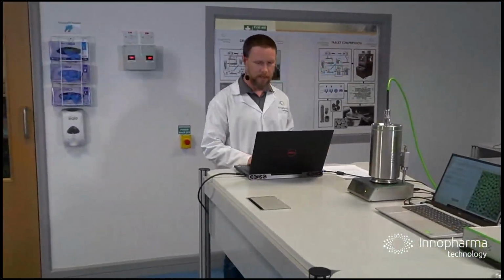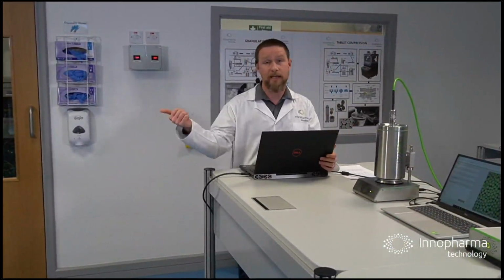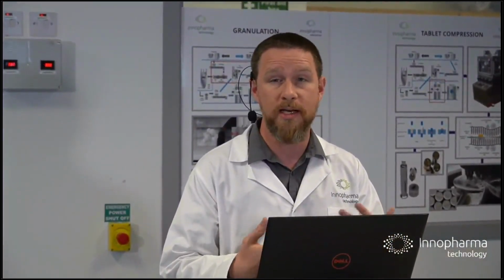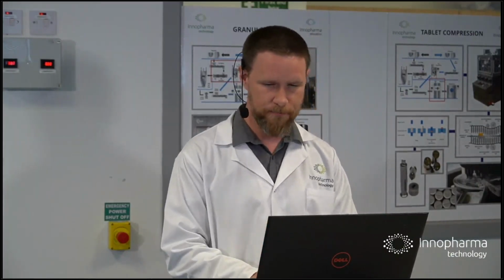So we're going to jump back in now and do some analysis. I'm going to take some data from our icon, from the inline icon actually, and we're going to take some data from sieve analysis. We're going to pull them into an Excel sheet and show what kind of correlations we can do. So hence this section was called Deep Dive in Excel, but I hope you stay with me for this and you get something from it. Okay, so let me just go back to sharing my screen.